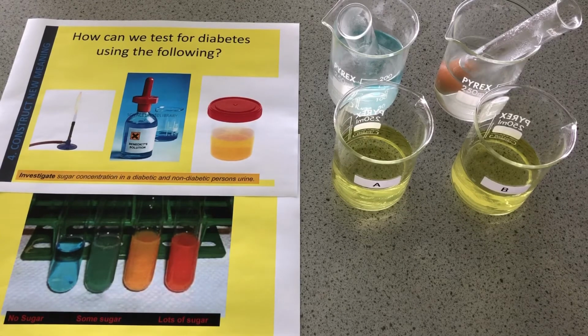Let's take a look at the results. So remember we said if there are high concentrations of sugar in the urine, that person has the signs of being a diabetic. That means that the excess glucose that was in their blood has not been transferred into glycogen and stored in the liver and the muscles. So that means that some of it gets filtered through the kidneys and joins the urine, and that's what we're testing here. We're testing our 2 urine samples, one that is from a diabetic, one from a non-diabetic.